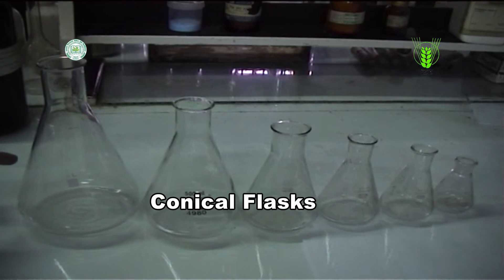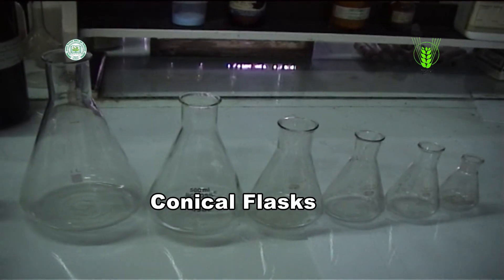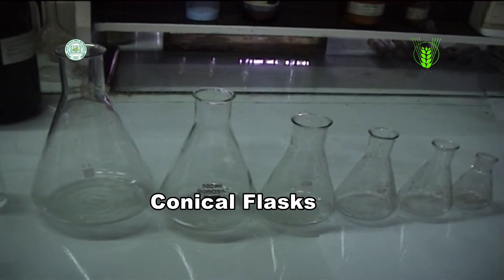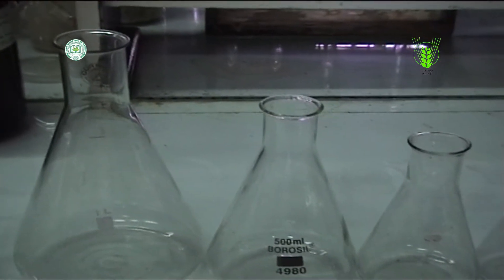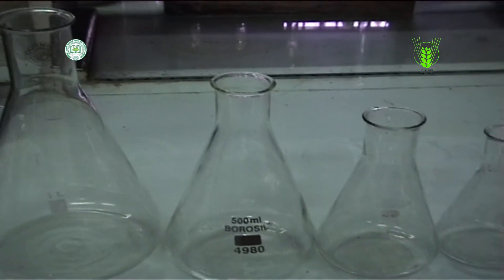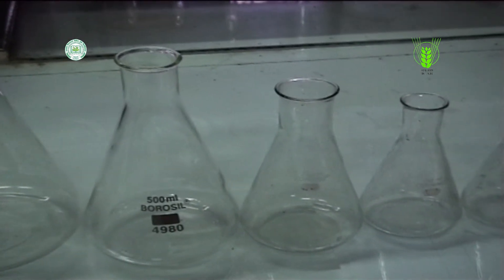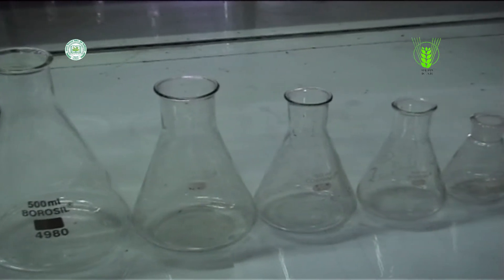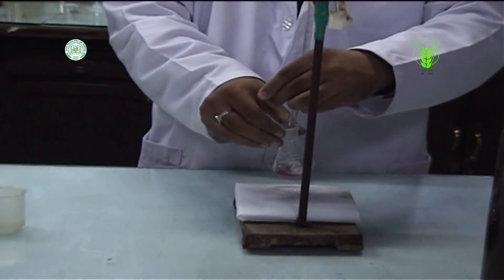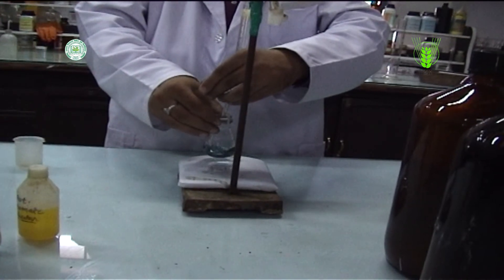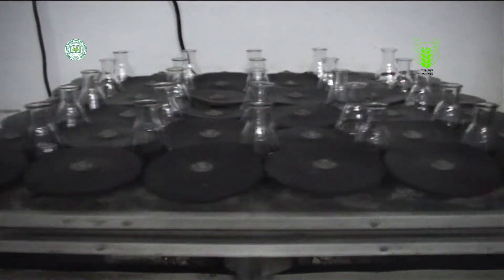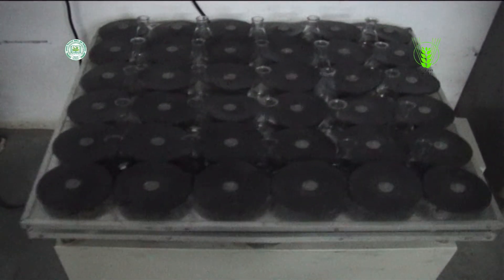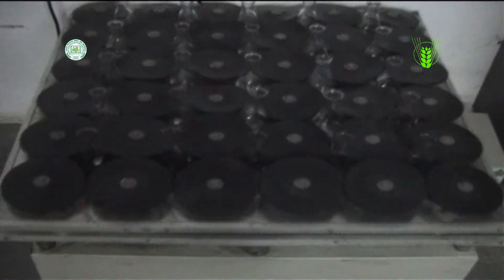Conical flask. These are conical flasks or laboratory flasks which can be used for making solutions or for holding, containing, collecting or sometimes volumetrically measuring chemicals, samples, solutions etc. For chemical reactions or other purposes such as mixing, heating, cooling, dissolving, precipitation, boiling as we do in distillation or other analysis.